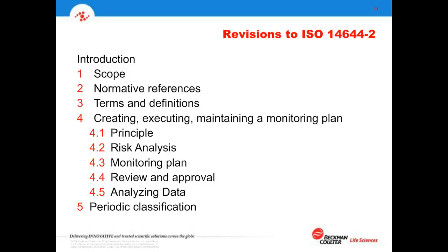And we do see, though, an interesting reference or increased reference to risk in this document for any industry. So we're talking about, do we understand if we don't monitor or monitor less frequently, do we open ourselves to greater risk for our particular process? So it has some discussion of that as well as looking at the methods to analyze the data.